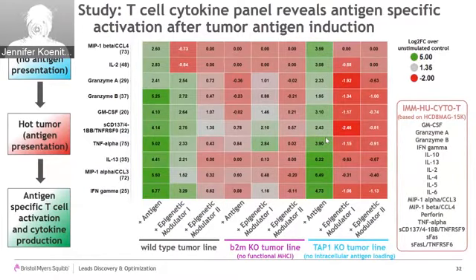It seems like the tumor cell is now, after treatment, able to be recognized by the T cell, and from other data, we know that it does indeed now express the antigen and present it on its MHC molecule. Epigenetic modulator number 2, on the other hand, didn't really work that well.